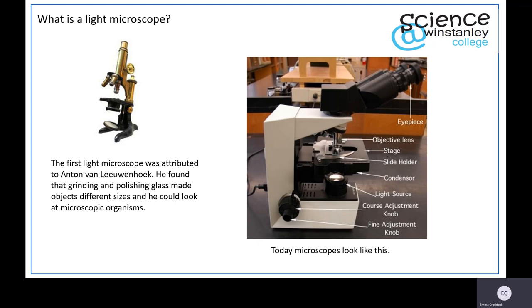Today the microscope has become more sophisticated. It still has the basic principles of that first light microscope with the different lenses, however we now have things like condensers to control the amount of light that can go through your sample, and course and fine adjustment knobs to focus that sample.